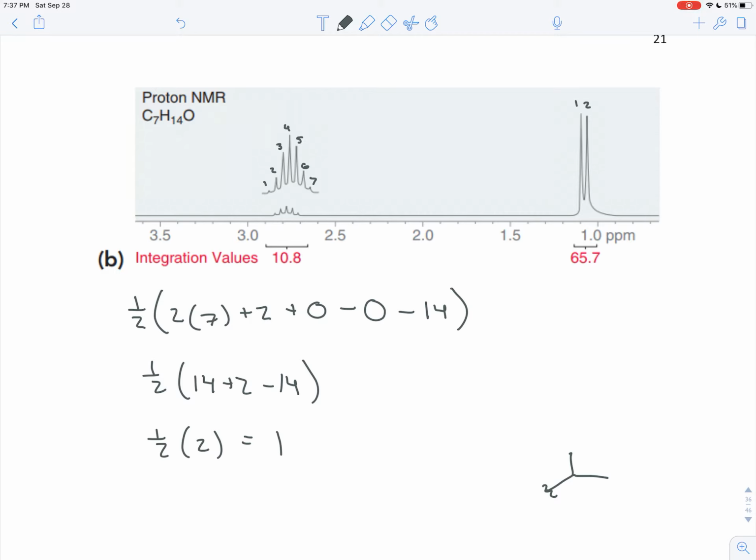But those are our only 2 signals. And here, we've only used 3 carbons. We have 7. And here you'll notice another pattern that you'll want to keep in the back of your mind. And that pattern is, if you have a lot of hydrogens and very few signals, then you probably have symmetry in the molecule. So if you have a lot of hydrogens and few signals, few different electronic environments, then you almost definitely have symmetry.